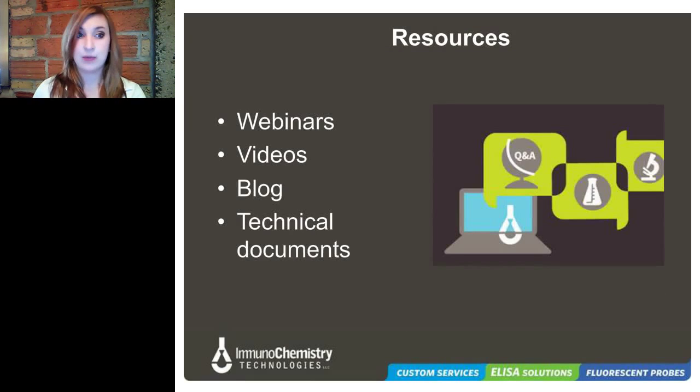So with that, that wraps up the variety of fluorescent probes I wanted to talk about today. We went through a lot, so to recap, we talked through FLICA for detection of active caspases, Magic Red for detection of caspases and cathepsins in real time, MitoPT to assess mitochondrial permeability and health, cytotoxicity tests, and FLISS for serine protease detection.